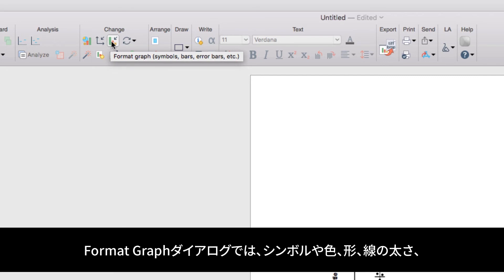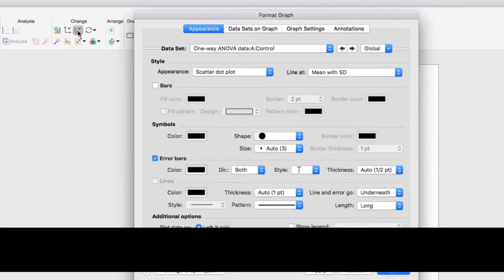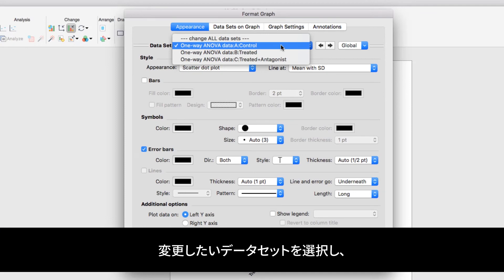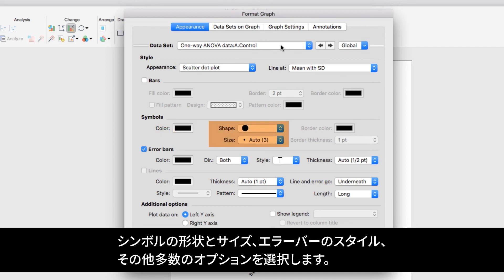The Format Graph dialog provides customization of the datasets including the symbols, colors, shapes, line weights, and other appearance options for your graph. Here you can see you can select the dataset you want to change, you can select the appearance, how the line and error are shown, the color of the symbols, the shape and size of the symbols, the style of the error bars, and many, many other options.